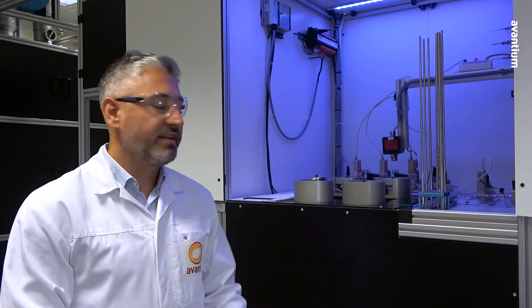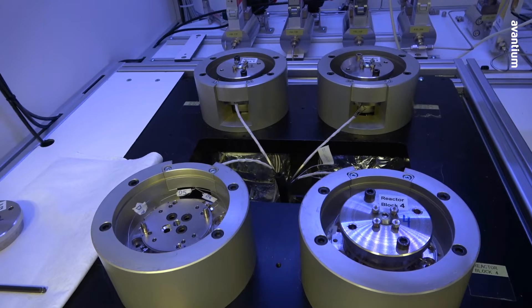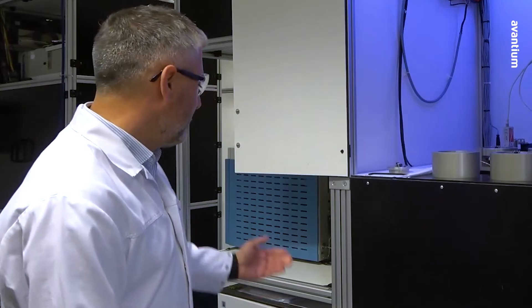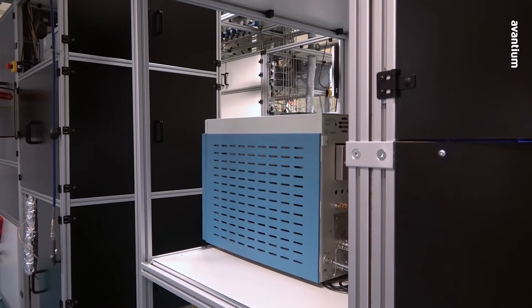This unit has 16 reactors in parallel. You can see here four blocks of four reactors each. And then here on the left side you can see the GC where all the gas products are analyzed.